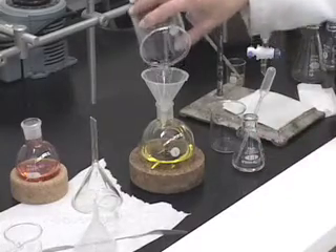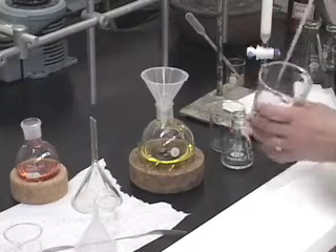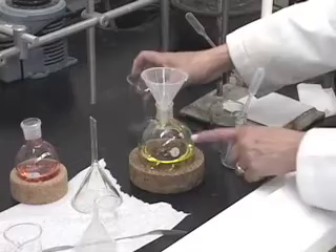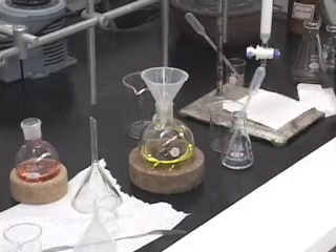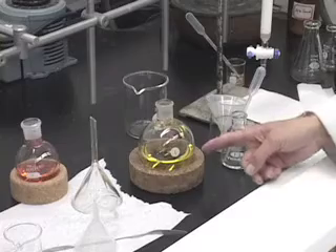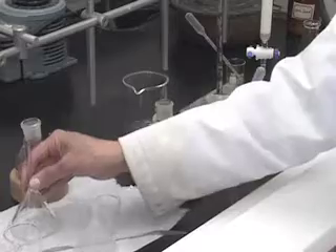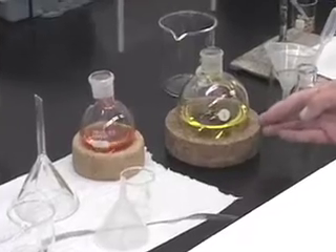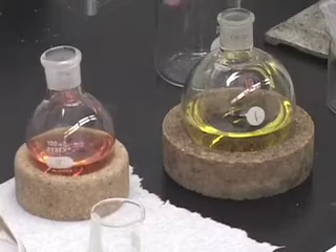Rinse, transfer, rinse, transfer — no more than one milliliter at a time — making sure that I never go above the half mark in either of the round bottom flasks. Once we have transferred that, our column procedure is finished. We are going to use the rotary evaporator to evaporate off the solvents, which will leave us with the solid components of the orange fraction and the yellow fraction separately. These were the two components present in the solid mixture we started with.